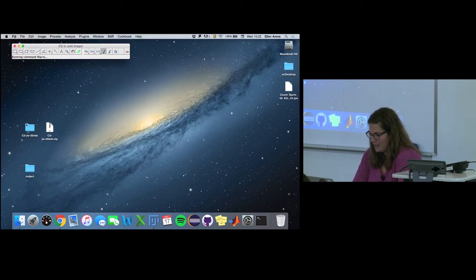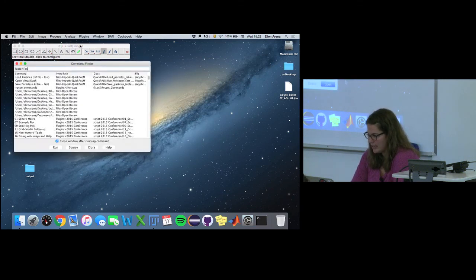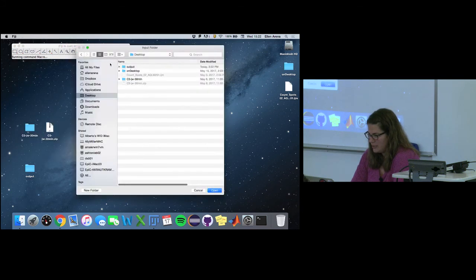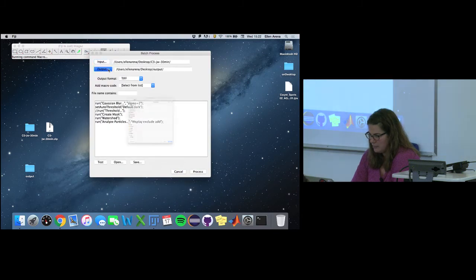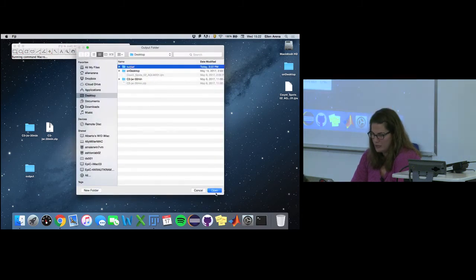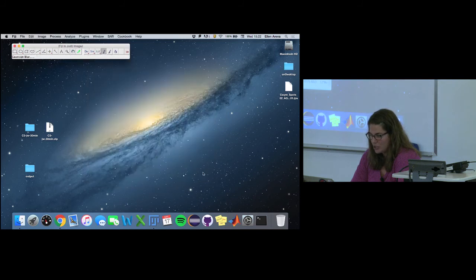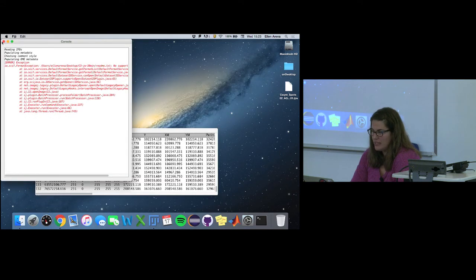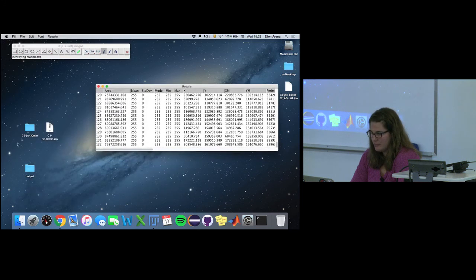I should have indicated, my input folder is this guy. This holds all of my images. My output folder is this output empty guy, and process. Right, okay, so there were a couple issues with something, I don't know, but it's going to just run that macro then, and then save the processed images in that folder, okay?